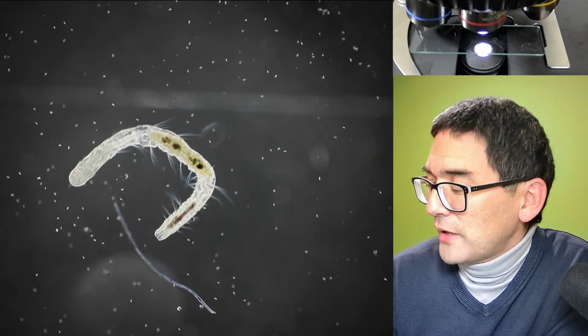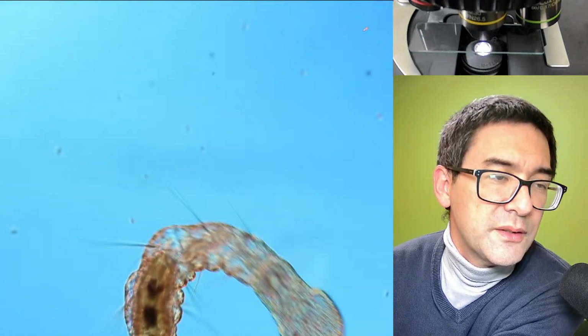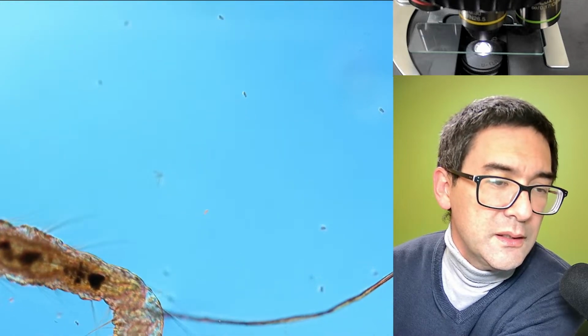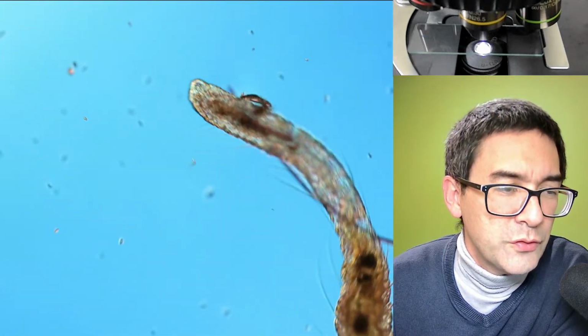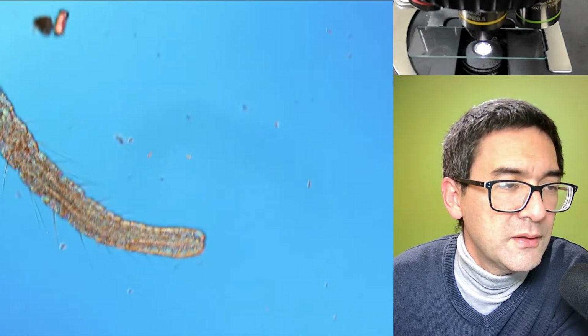You know what? Now I'm going to switch over to the other contrasting technique, at a higher magnification, because here we see more details. Yeah, but it makes it much more difficult, of course, to chase it around. And in this sample we can also see some single-celled organisms. They're too large for bacteria, but probably ciliates or flagellates or whatever also in the sample. So that's a smaller one again.